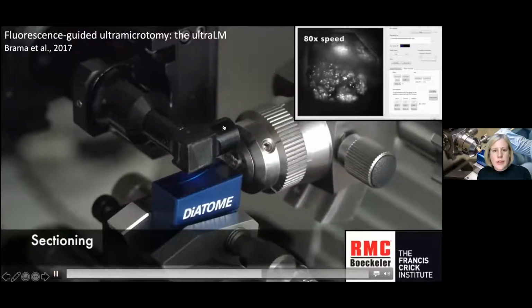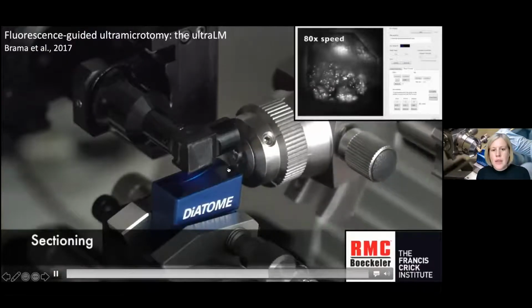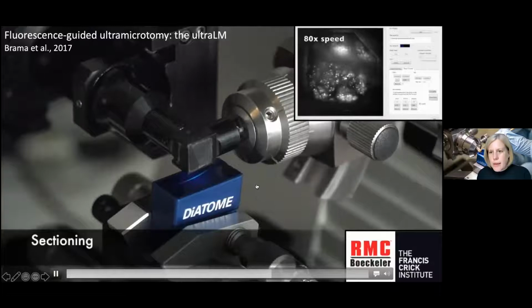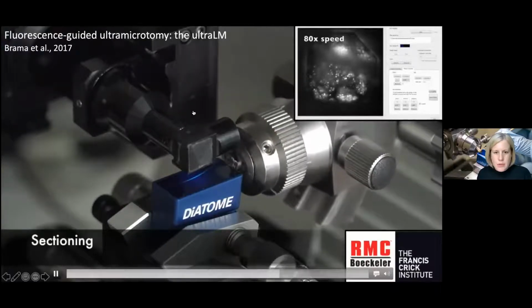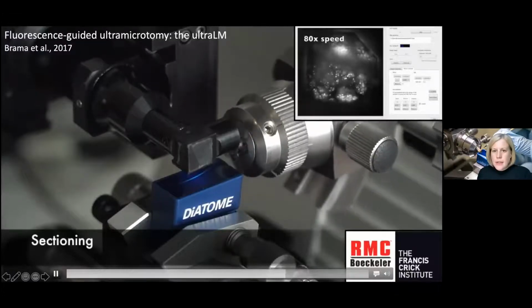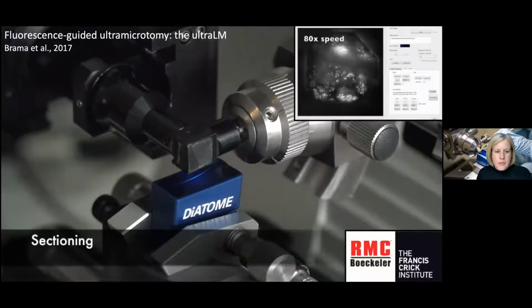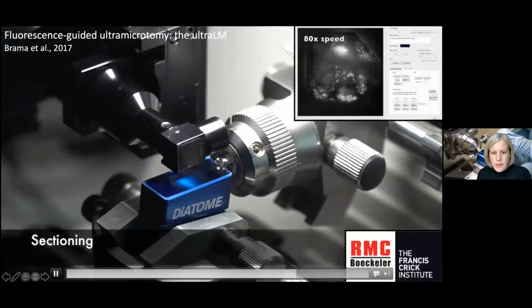So one of the challenges here is fitting this kind of miniaturized light microscope into the ultramicrotome. The diamond knife here is worth about £2,500. So you really don't want to hit it with a big bulky objective. And you don't want to introduce any shaking into the system because otherwise you're going to affect your cutting.